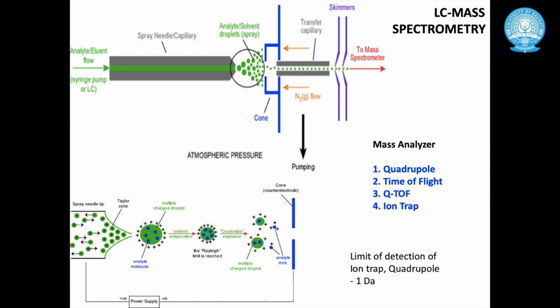Since the inside is maintained at a high temperature, these droplets keep on shrinking, and when they come out from the spray needle, these droplets are charged also.